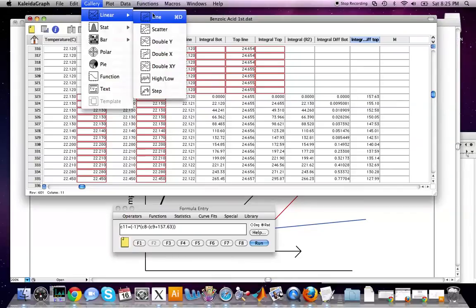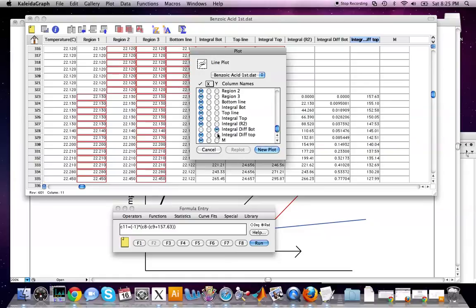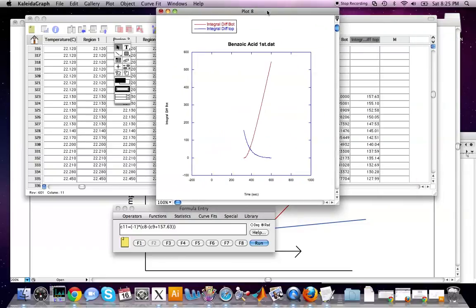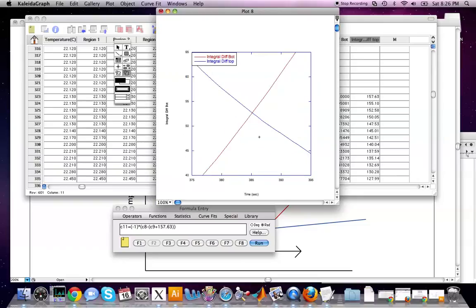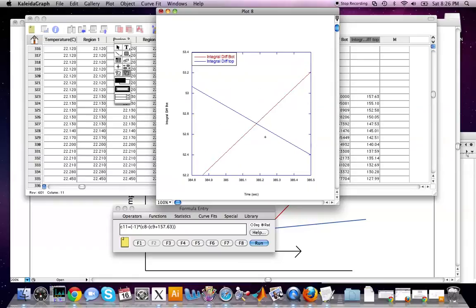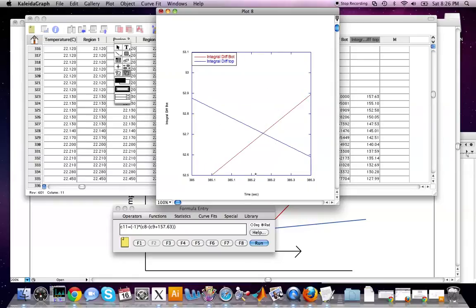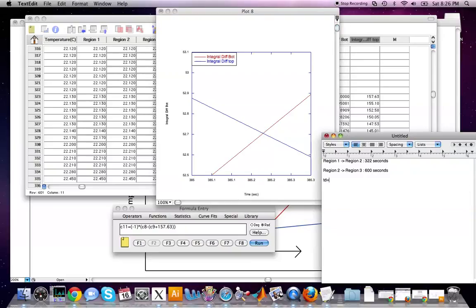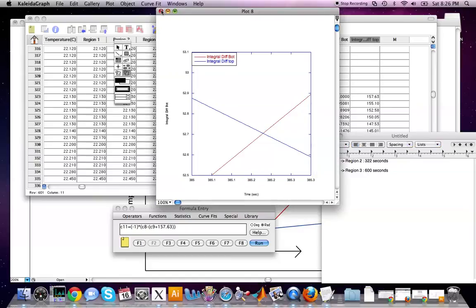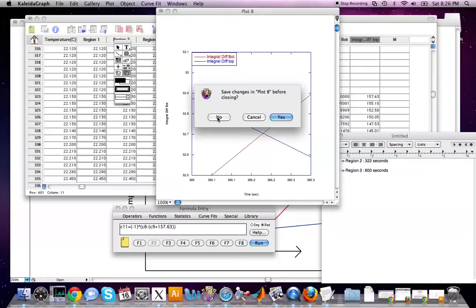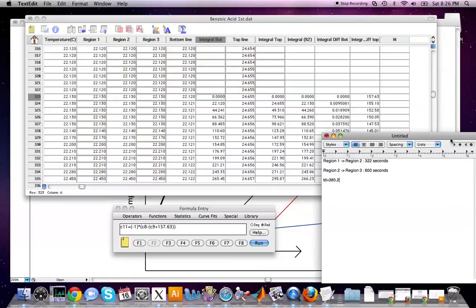Make a line plot with time on the x-axis and both integral difference columns on the y-axis. To find t_d, zoom in closely to the intersection of these two curves. For this example, t_d equals 385.2 seconds. Once you've found t_d, the hard work of finding delta T is essentially done.